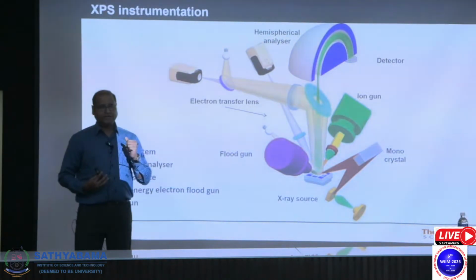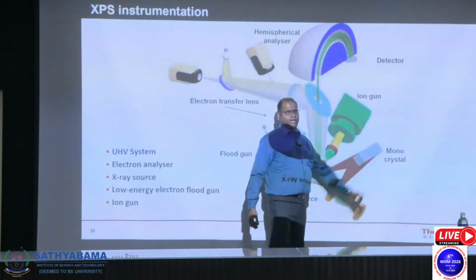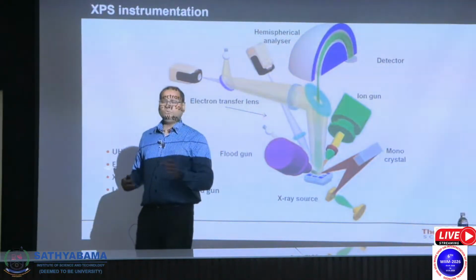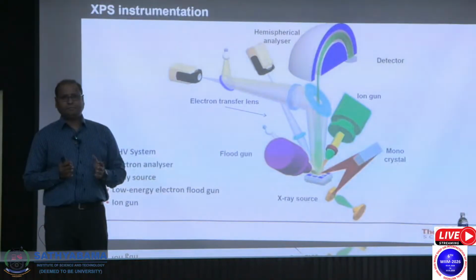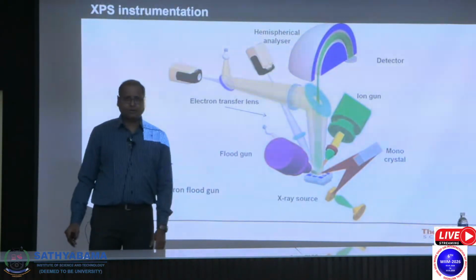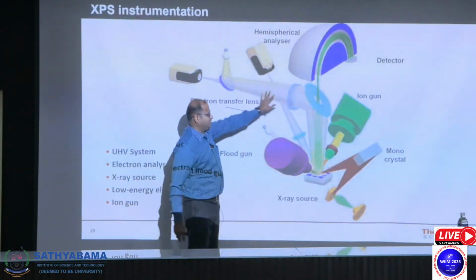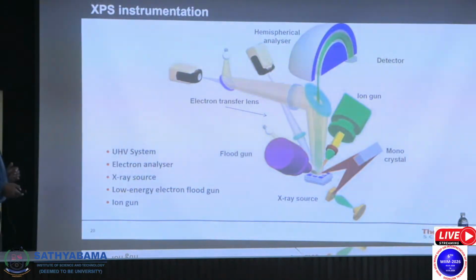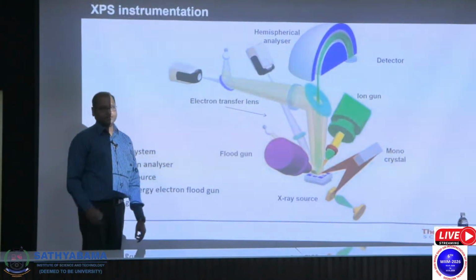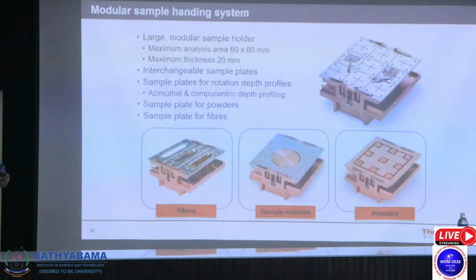And how do I do my surface cleaning? For such a small area, the top few nanometers, I use this argon ion gun. I use a very mild energy and I remove the contamination from the surface. And as I do all these experiments, which area I'm looking at on my sample, whether my region of interest is there or not, that comes into the picture with the help of all the lenses attached here. These lenses help you to go to your sample of interest, navigate and select your region of interest. So the next time you go to an XPS lab, try to identify all these important parts which are present in every single XPS, irrespective of the manufacturer.